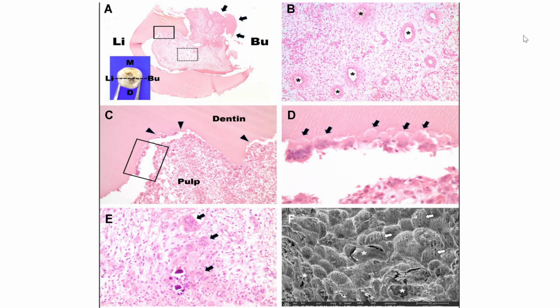The inflammatory infiltrate consisted mainly of lymphocytes and histiocytes with scattered mast cells and neutrophils. The dentin surface was devoid of an odontoblast layer and instead lined by a row of odontoclasts occupying resorption lacunae. These multinucleated giant cells were found sparsely within pulp tissue and accompanied by putative mononuclear odontoclast precursors. Scanning electron microscopy of dentin walls shows surface irregularities from various depths of resorption lacunae.